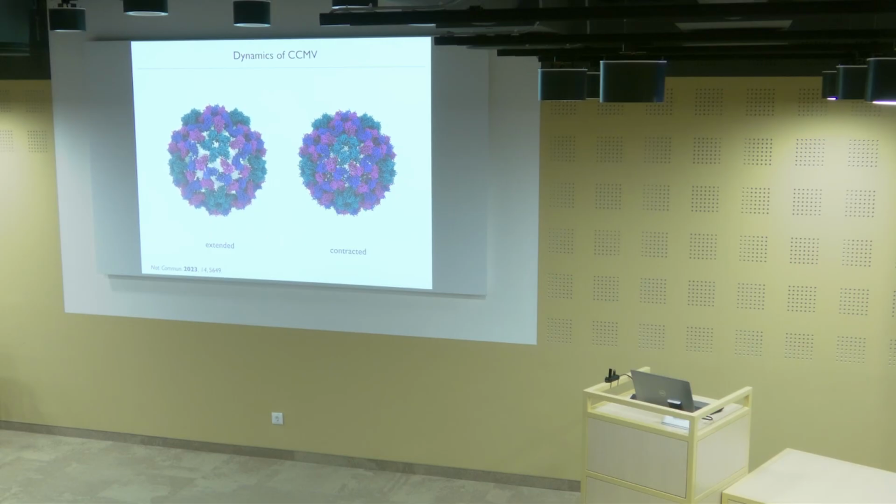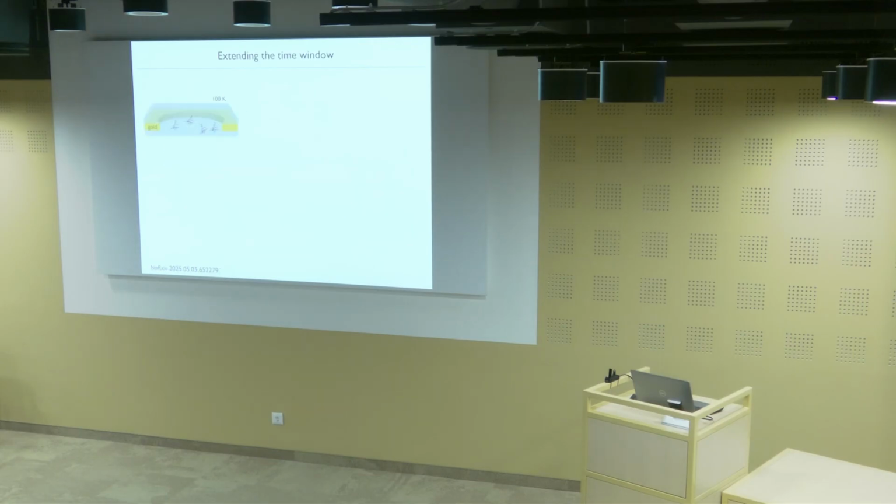And so now what we've done is we've gone quite broad, looked at very different systems, at membrane proteins, very delicate proteins. And so it seems that this method really is quite general, and should be applicable to a wide range of systems. There's one more thing I wanted to talk about very briefly before I run out of time.